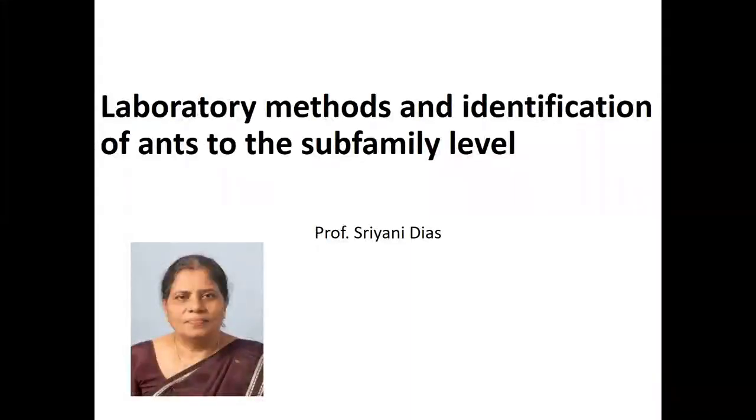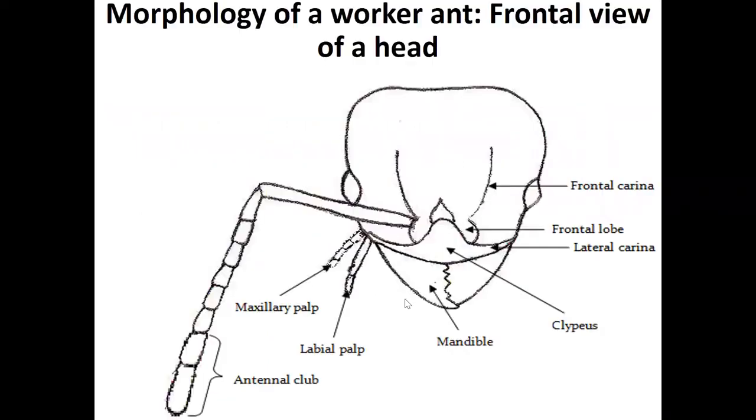Good afternoon, everybody. Now I am going to talk about laboratory methods and identification of ants to the subfamily level. It's very important to know the laboratory methods, and then how you can identify an ant to the subfamily level.